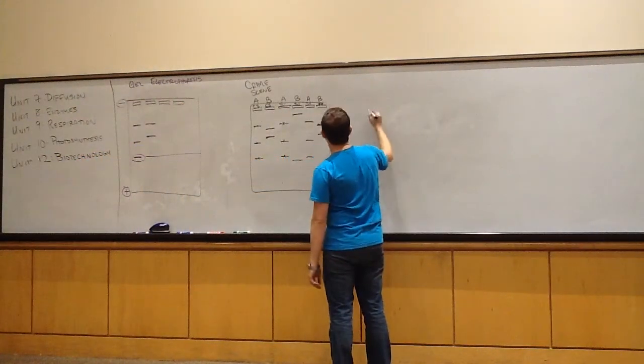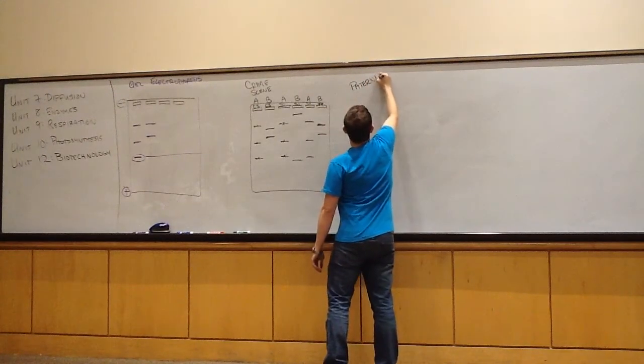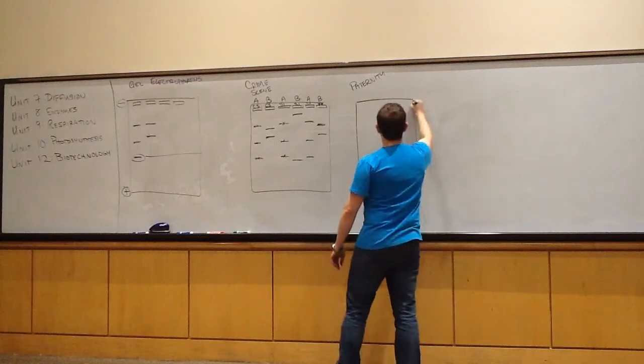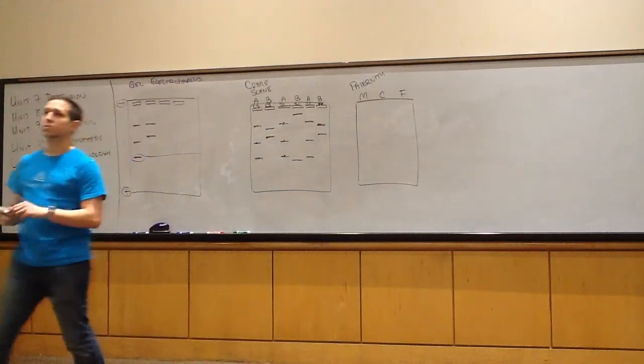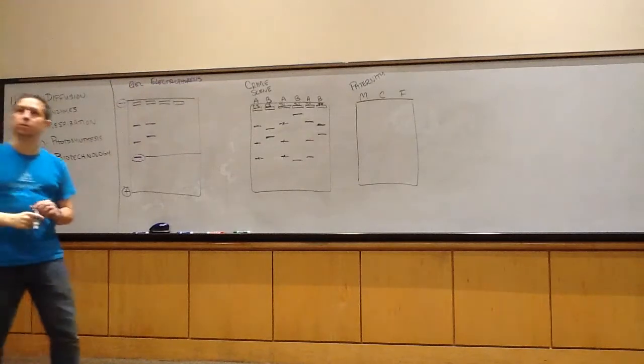Now let's go on the Maury show and let's do paternity testing. All right? All right. So we're going to have a maternal lane, a child lane, and we're going to do it very simply, just a potential father lane. I can extend it if you need me to. We can do multiple potential fathers.